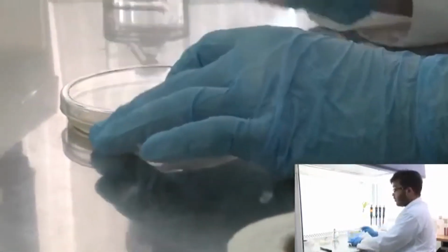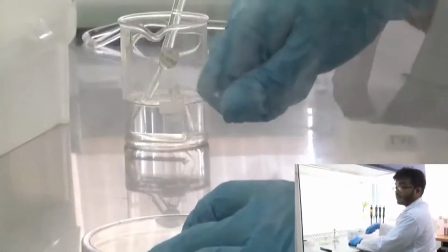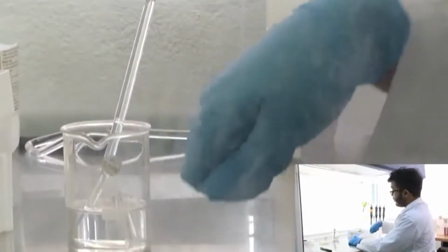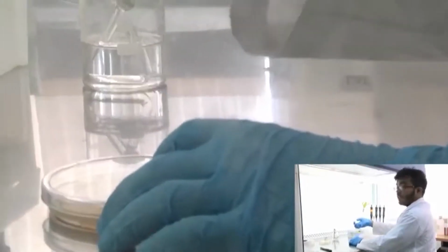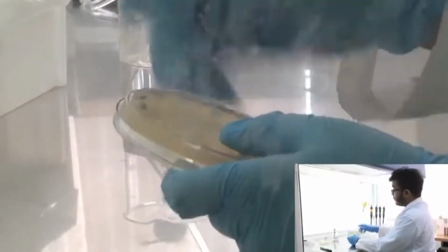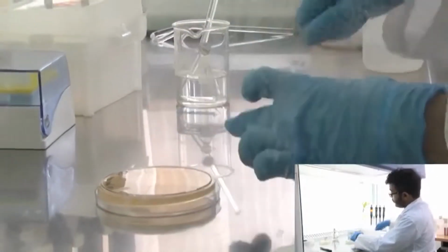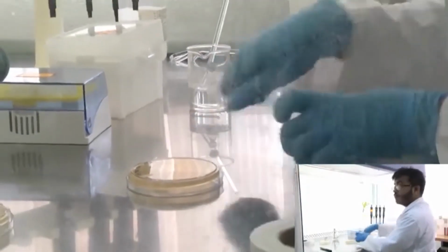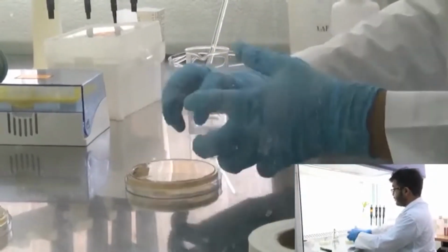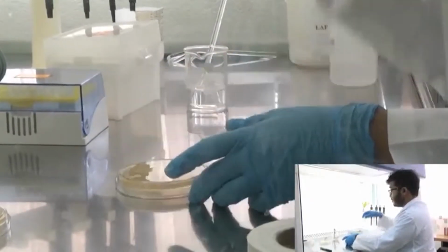Always keep in mind when you are spreading that your hand should have a uniform pressure. If you put in too much pressure, there is always a chance that you are going to break apart clumps of the LB agar, and so you'll ruin your plate. So your hands should be steady, and there should be a steady uniform pressure, and you should be rotating your plate uniformly. Too much pressure can actually break the LB agar plate into fragments and crumbs, and that is going to mess up your experiment.